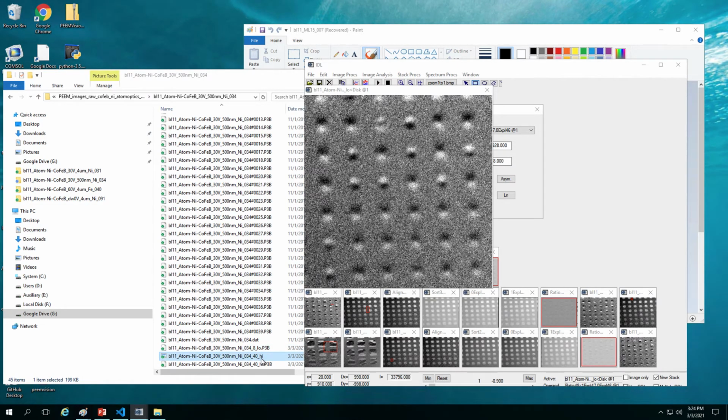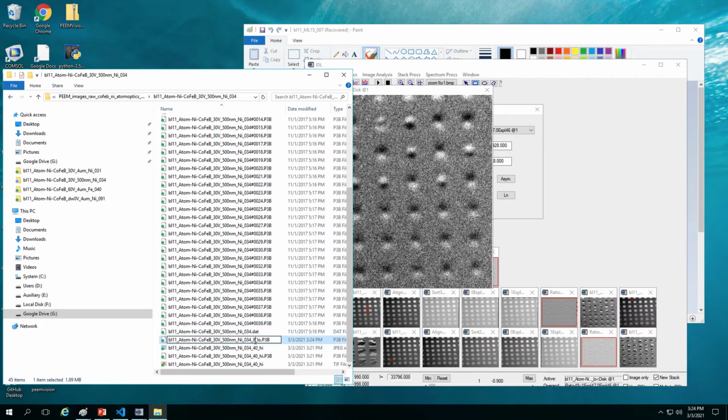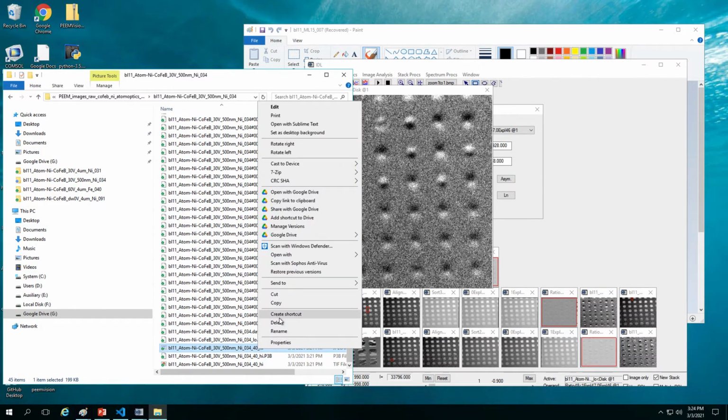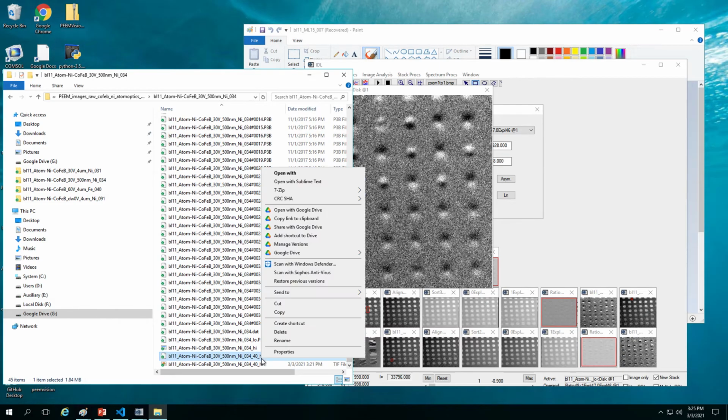So when we're doing the programming, it will be easier for us to do the naming. Got me? Okay, so let's try to rename without this. Similarly, so now they look the same, just that the postfix is different.